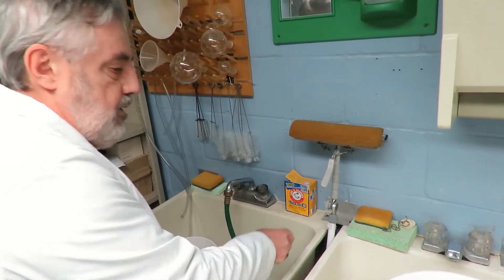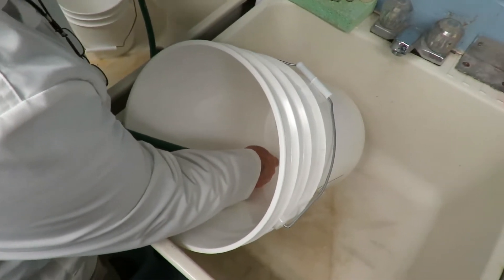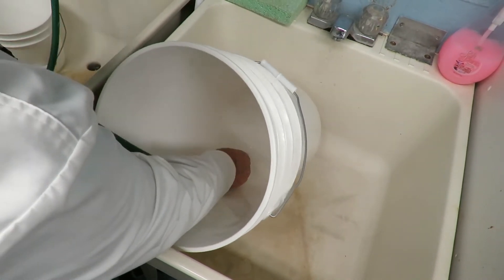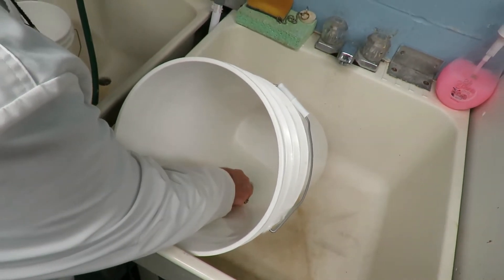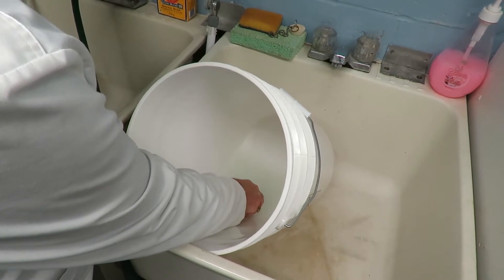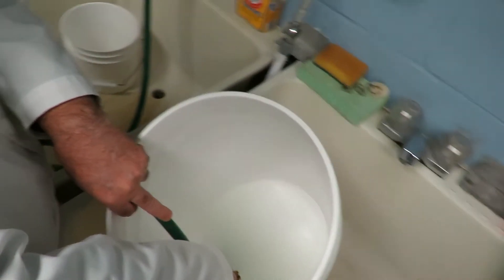Once you've run the water for 20 minutes, you're ready to fill your bucket — use the biggest bucket you can find. First, cover the tip of your hose with water to prevent any splashing, bubbles, or agitation in your sample, and fill the bucket very slowly while keeping the tip of the hose always covered at the bottom.